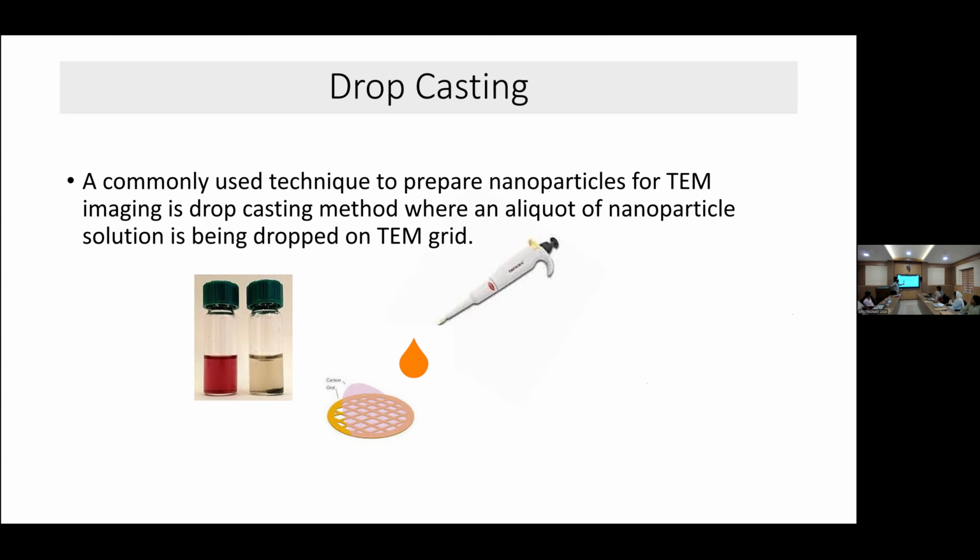That is because those are microparticles or bigger particles that will settle easily. Nanomaterials will not settle this easily. Okay. That's the first thing. You just shake your sample or sonicate it and then hold for some time. You can see the particles coming down. If that is happening, then your sample has some bulk materials.